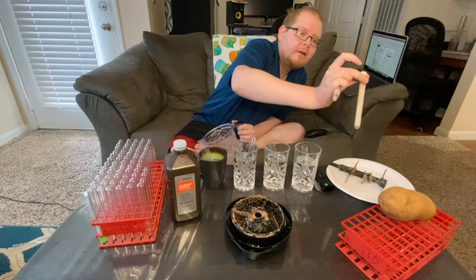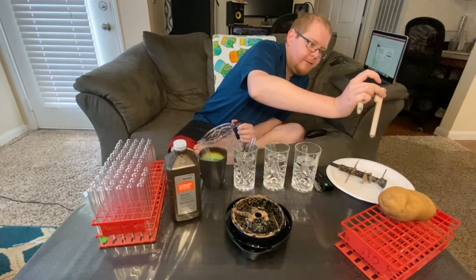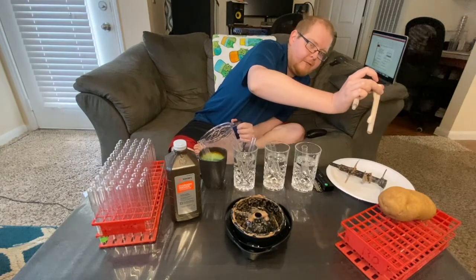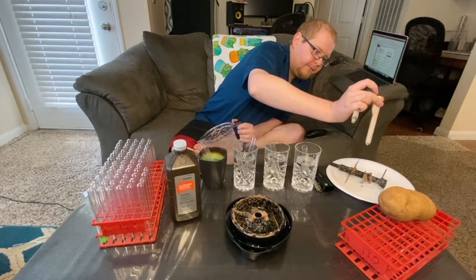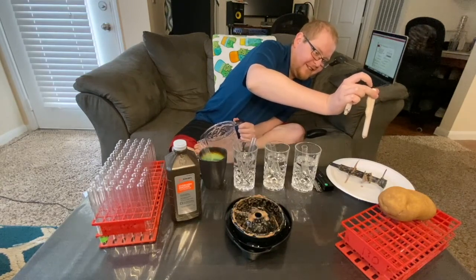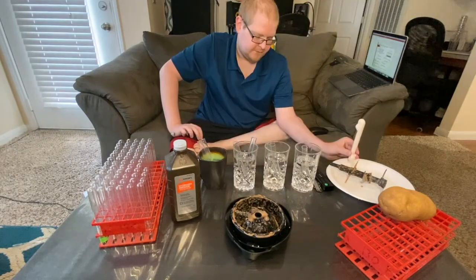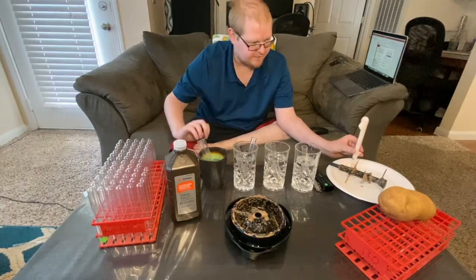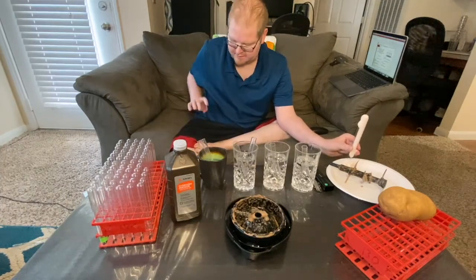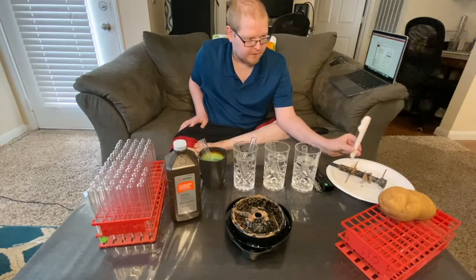That one actually bubbled over. So that may have been a bit much. But that's what catalase does. I don't know if I'm going to be able to do the rest of these, because it's probably going to bubble up too much, especially in the hot water.